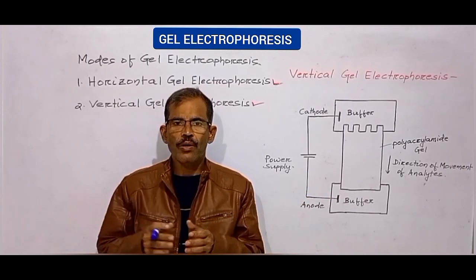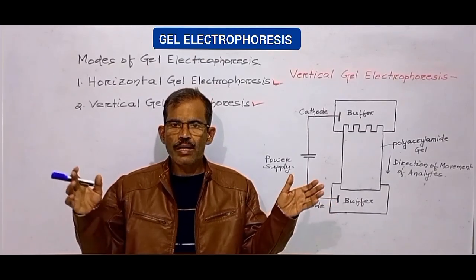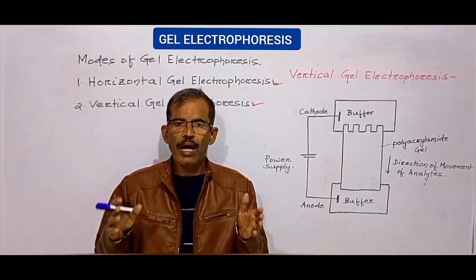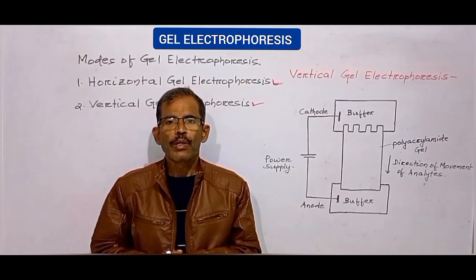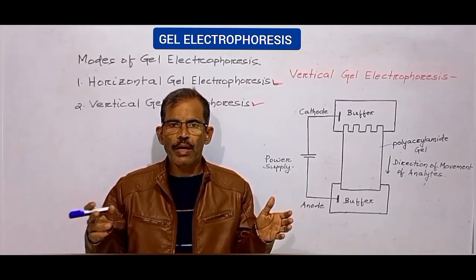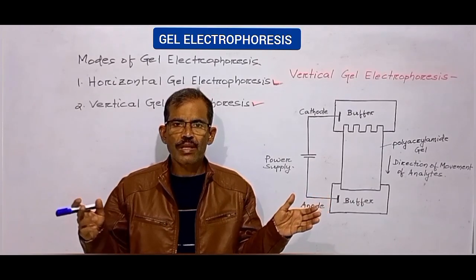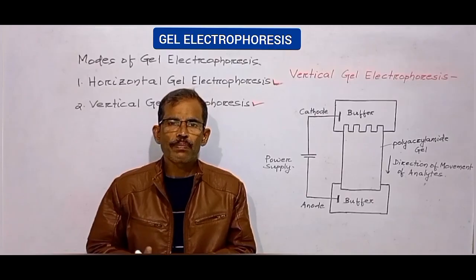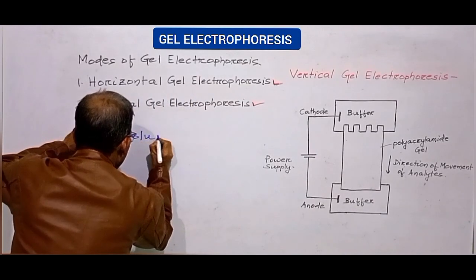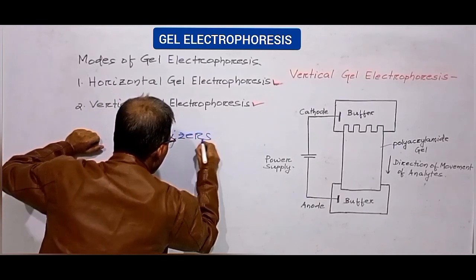Such proteins are called oligomeric proteins, in which the subunits are held together by hydrogen bonds, disulfide bonds, and hydrophobic interaction. During electrophoresis, such proteins migrate as a single band. But if one has to study the individual subunits separately, then a class of compounds called solubilizers are used.